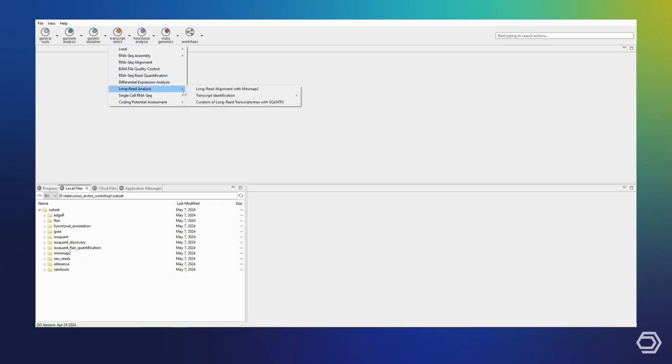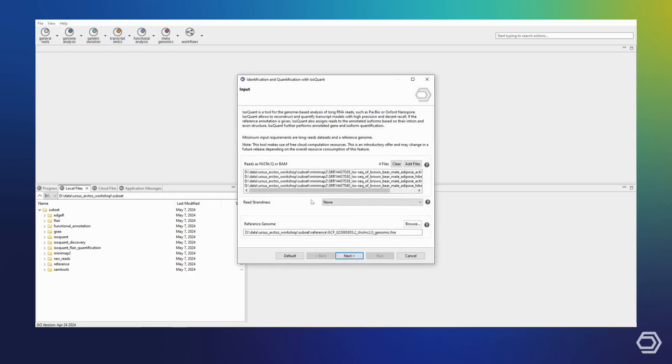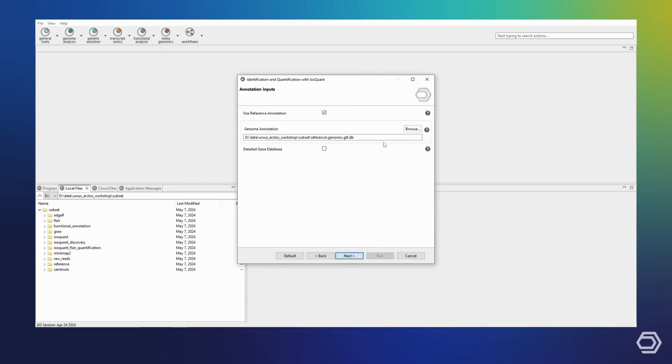On the first page, I will use the same settings. Note that we still require a reference genome. On the second page, I will select that this time we do not want to use a reference annotation.